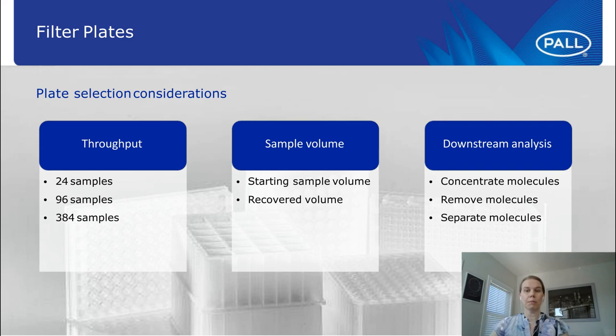And again, downstream analysis, as I already mentioned, just knowing what exactly you're trying to achieve, is it to concentrate molecules, to remove molecules or separate molecules, will help to really select the right filter plate for you.